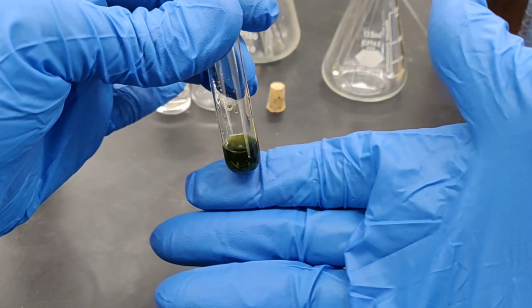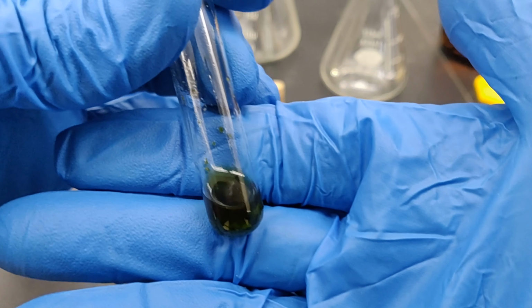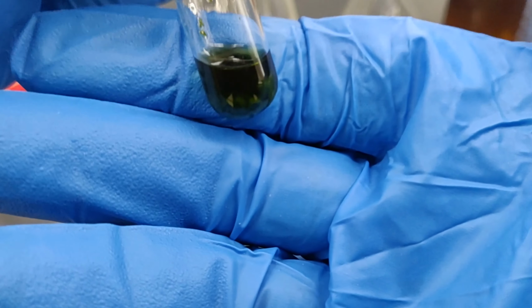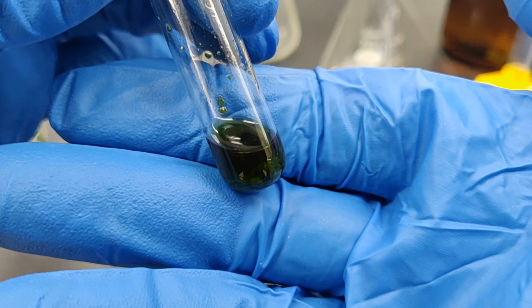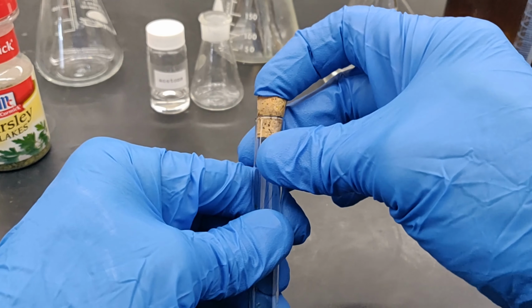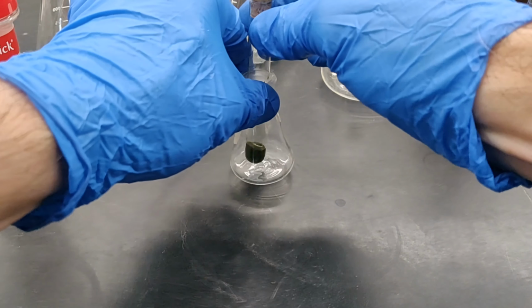This should result in a dark green suspension. Cork it and momentarily set it aside standing upright.